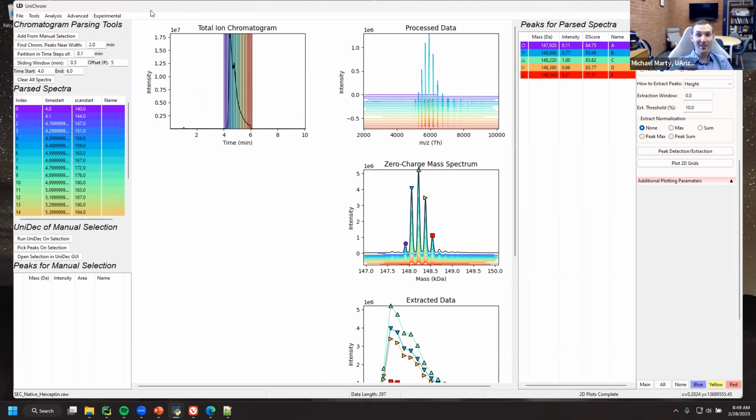It's a tool that is pretty crude, and if you find yourself using it a lot, let me know if there are tweaks, because we could build a little window to time it in specific ways. But it's kind of useful for when we're on the instrument and trying to tune things. It's useful just to click refresh, and it pops up, and then you can adjust it.